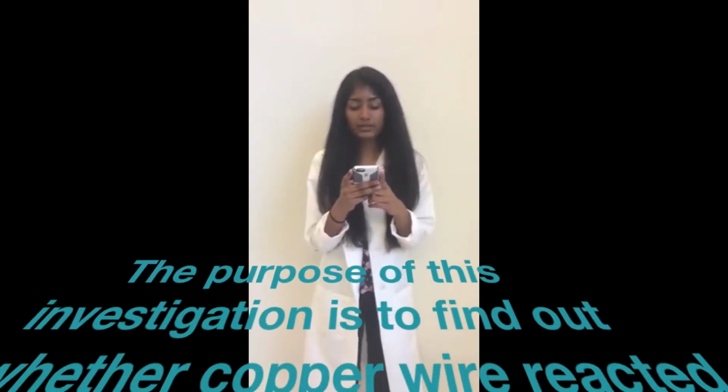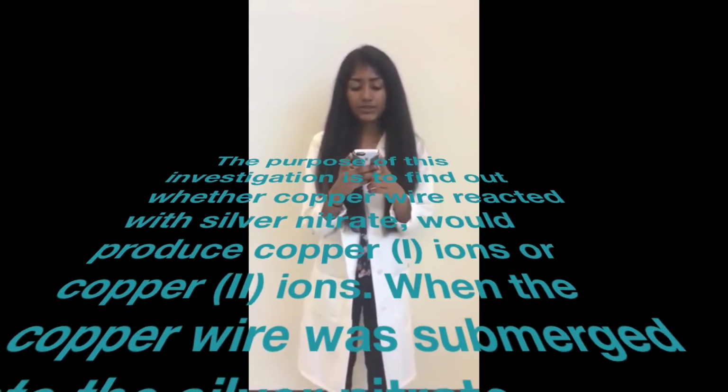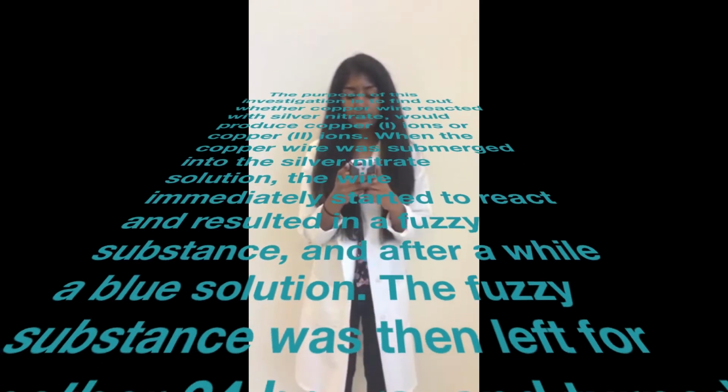The purpose of this investigation is to find out whether copper wire reacted with silver nitrate would produce copper 1 ions or copper 2 ions. When the copper wire was submerged into silver nitrate solution, the wire immediately started to react and resulted in a fuzzy substance, and after a while, a blue solution. The fuzzy substance was then left for another 24 hours and turned into silver crystals.